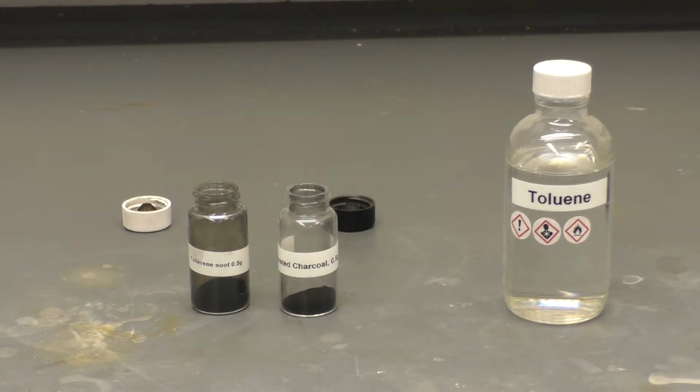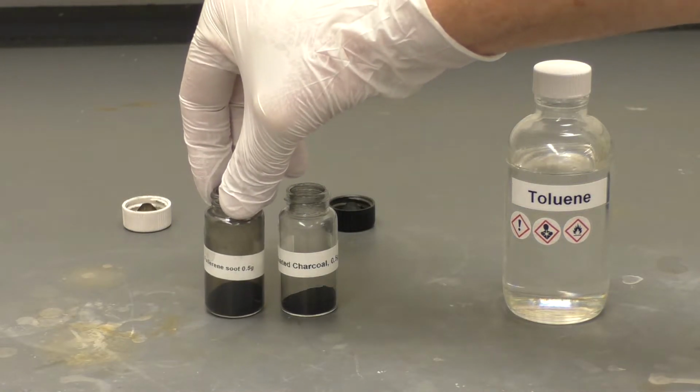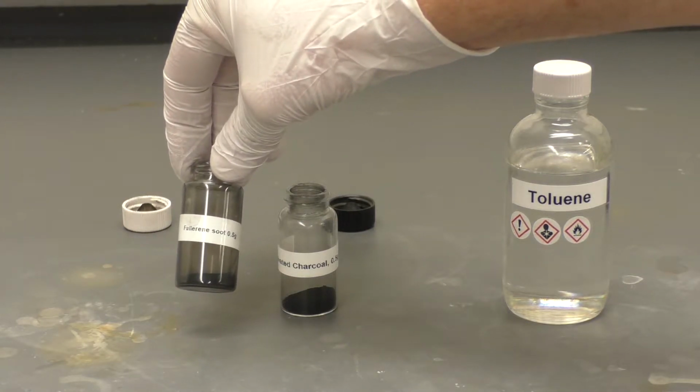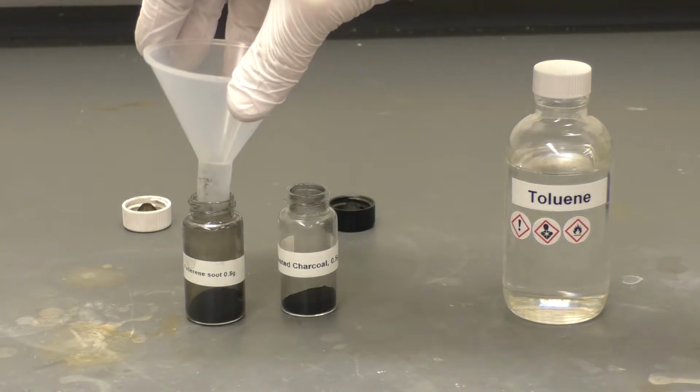And on the left over here, we have some more just soot. Again, very similar to charcoal, just random bonding of carbon to other carbons, nothing regular. But it also has been manufactured with some fullerenes, C60 and C70 in there. And so what I'll do now is add toluene to both. We'll shake them up, and then we'll look to see if there's any difference in what has gone into the toluene, if anything.